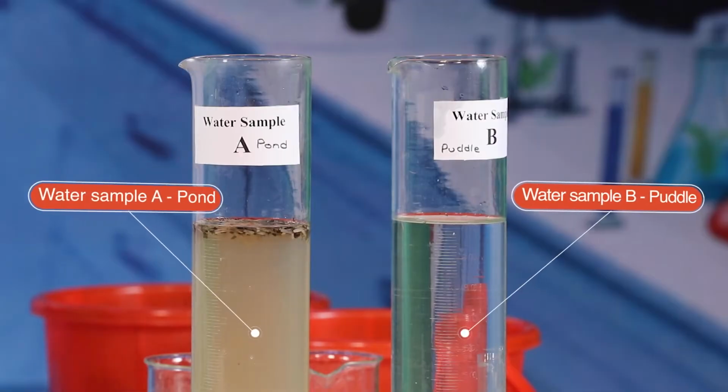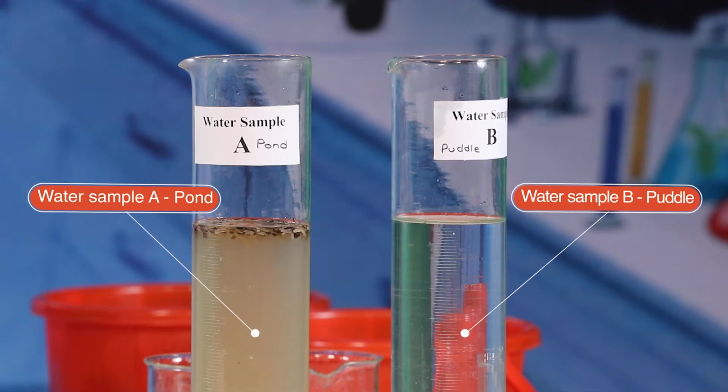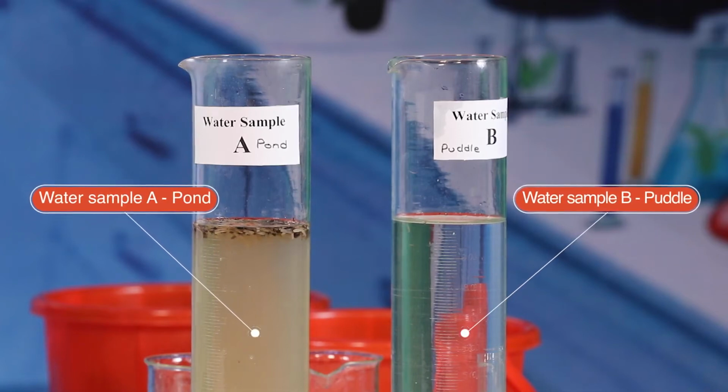Label each water sample to indicate the site from which the water sample has been collected.